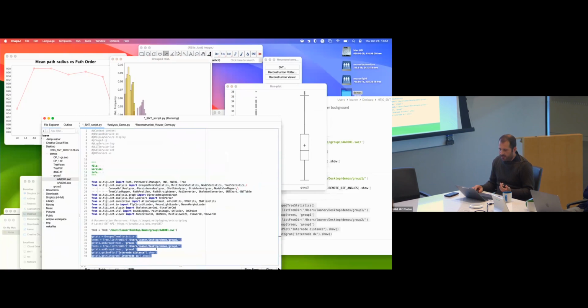And there's more sophistication to it, but I think that's really too in the weeds for the type of analysis that I think you guys would be interested in, unless you are really passionate about knowing how many branch points there are in the subiculum or on layer 3 of secondary motor cortex or something. So in a nutshell, that's it.